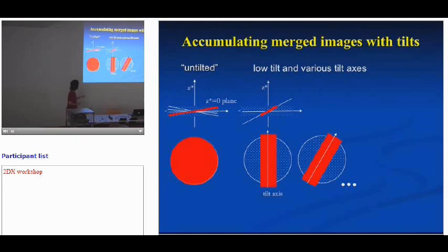Of course, when you are doing this, the best idea is to do a number of them. So you will usually take not just one tilted image in the merge. Each time you do this, it's best to take a group of them. That way you build up not just one line, but more like a zone of it.